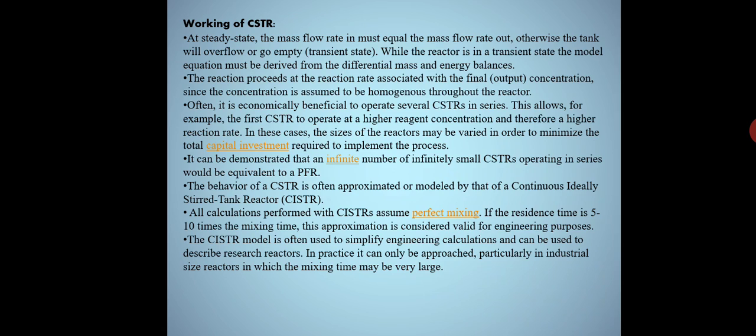2 और 6 ब्लेड्स आर बीन यूज्ड, मीन्स 2 और 6 जो इम्पेलर को ब्लेड्स कनेक्टेड है वो 2 या 6 काउंट में ही मेजर प्रेजेंट है। सो द number and the design is been fixed, so there is simplicity in the construction.